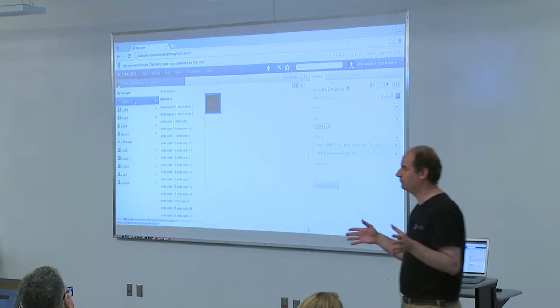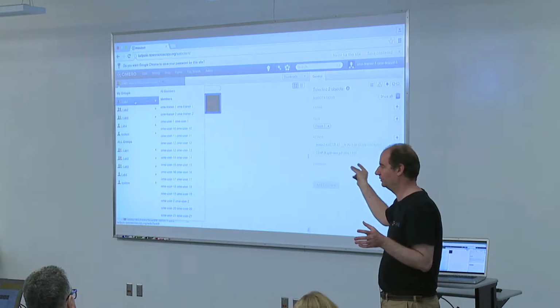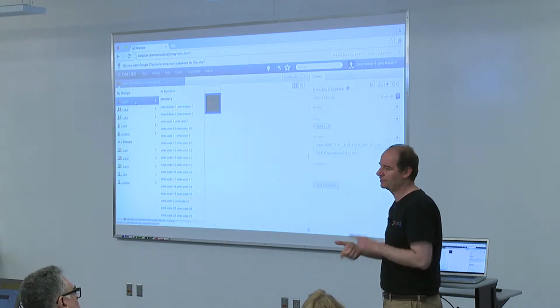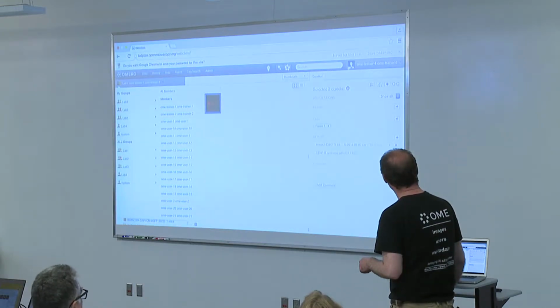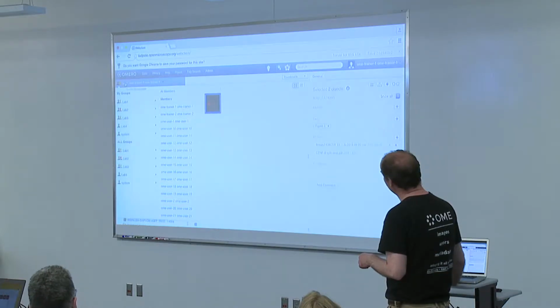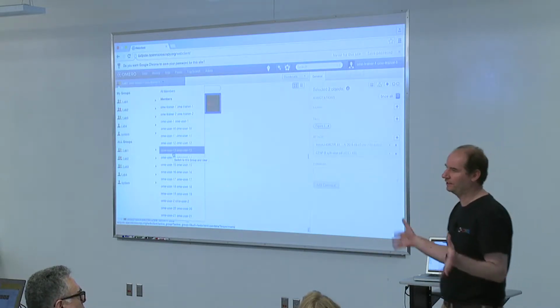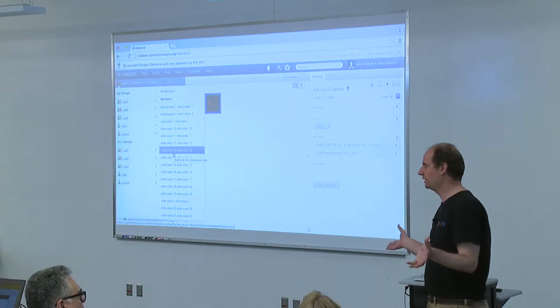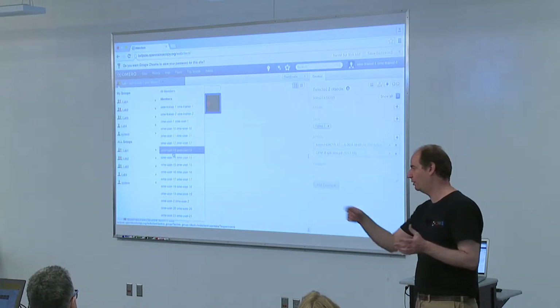We are actually all in one group, and you can see all the things I am showing you, not on the screen, but in OMERO Insight and in OMERO Web. How? Well, if you are now logged into Tadpole, you have here something which says OME-user-21. If you click on this icon saying Lab 1, then go here, you will see more or less these members. This is a group which is called read annotate, and it does what it says on the box. So you can read and annotate my data or anybody's data which is belonging to the groups. We are all in the same group.